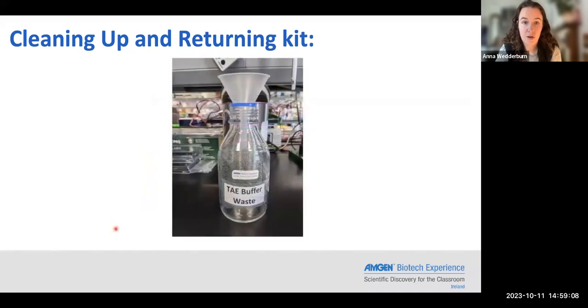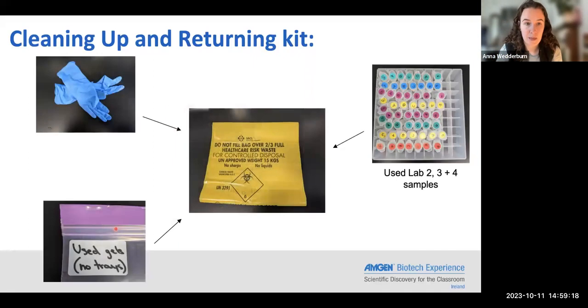In terms of the TAE that you used, we give you a funnel and a TAE buffer waste bottle. So just pour it all back in there. We take all that back.